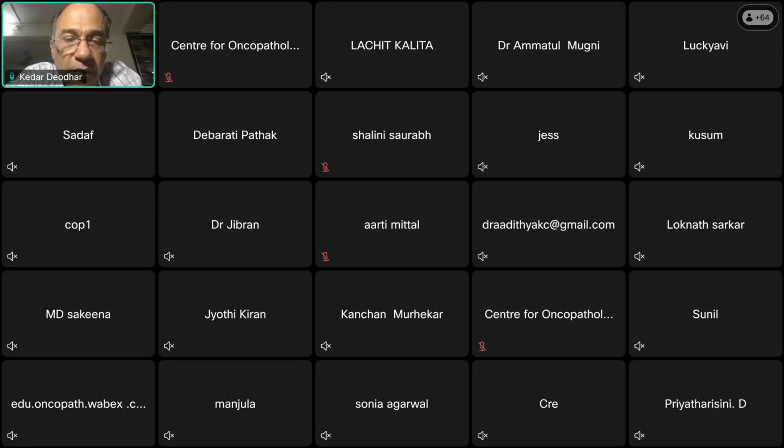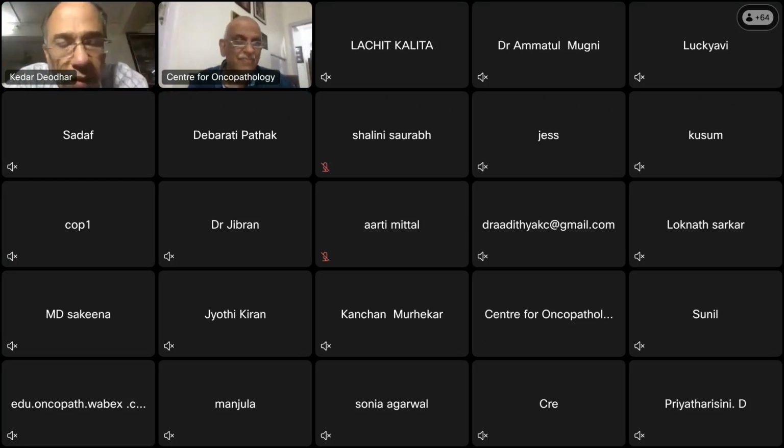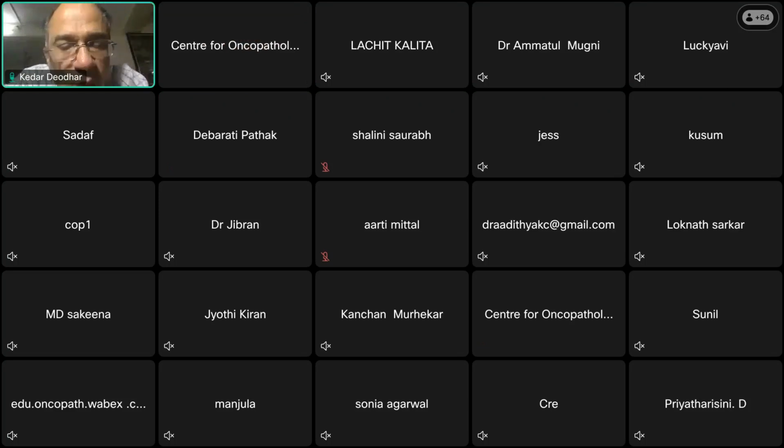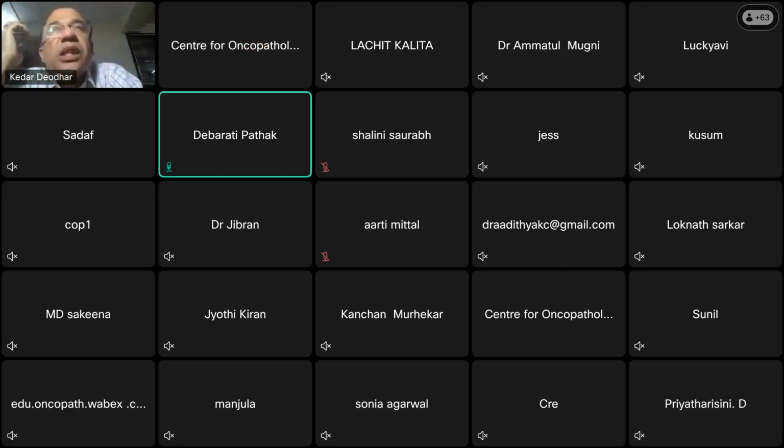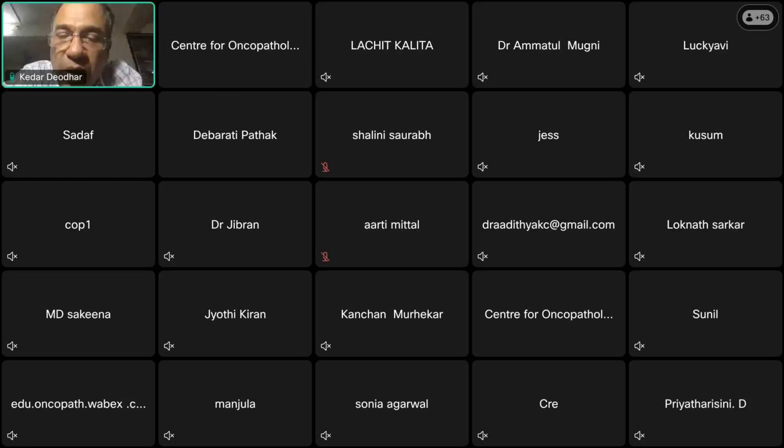Okay, sir. How many sections should be taken in post-NACT cases, in which organ? Colorectal. How many minimum sections? The minimum should be 4, guided by the area of abnormality.